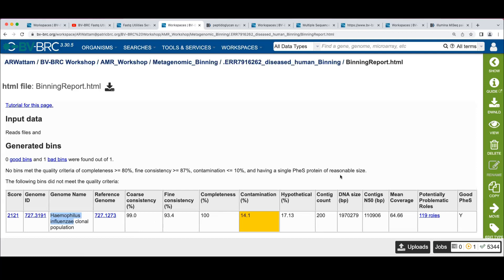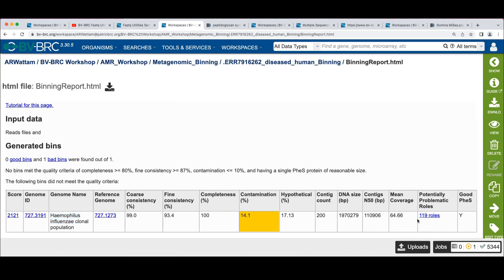And now we've just got some metrics. We have 17% hypothetical genes, 200 contigs, so it's pretty broken up, and some sizes.